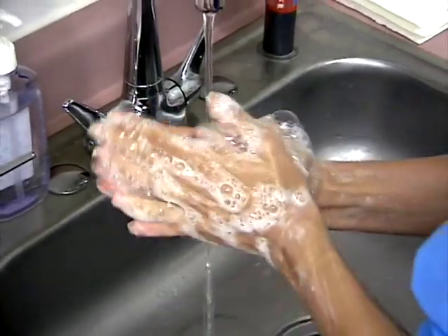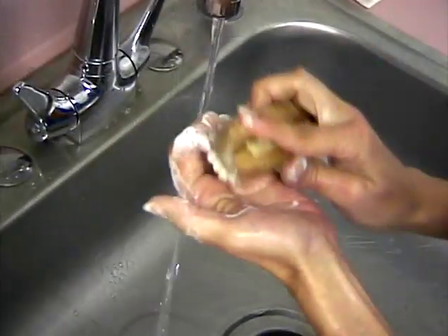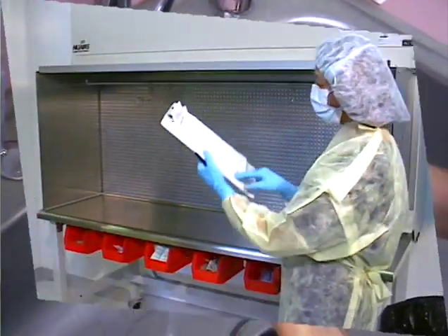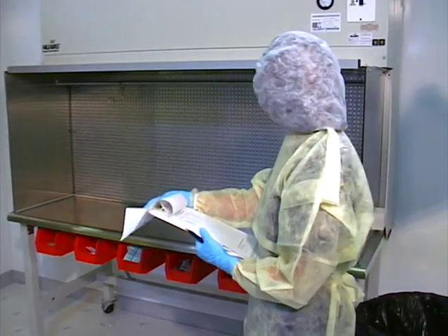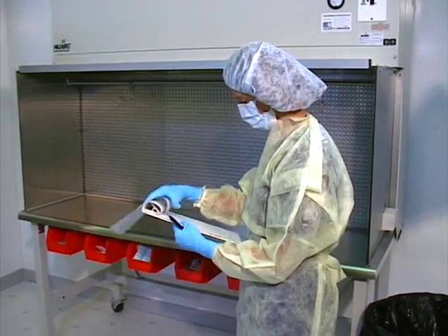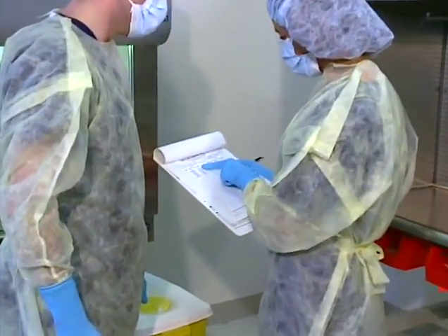Personnel should thoroughly wash hands, arms, and clean the fingernails with mild soap prior to donning the required apparel. At the beginning of the shift, the operator should check all data logs, such as refrigerator and freezer temperature, the hood cleaning logs, and any other data entry records, verifying completeness and making all entries as required. Any out-of-limits condition should be reported immediately to supervisory personnel.